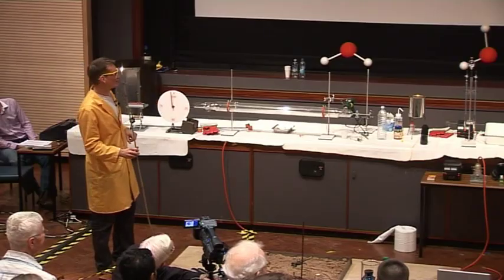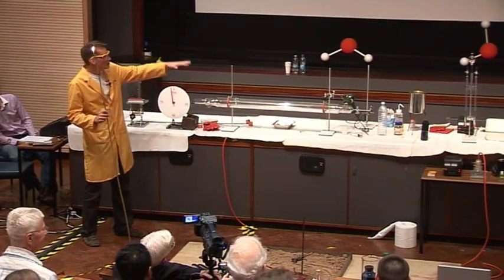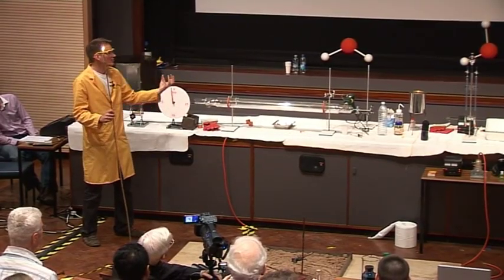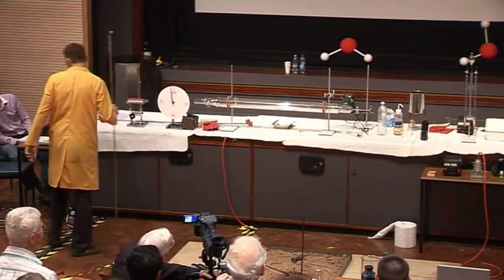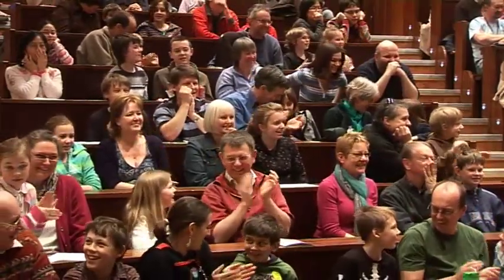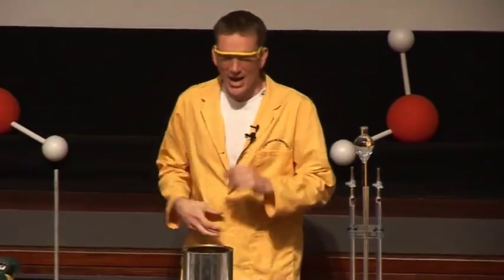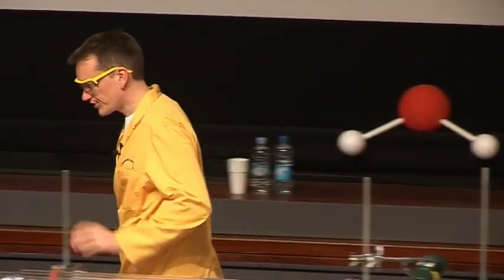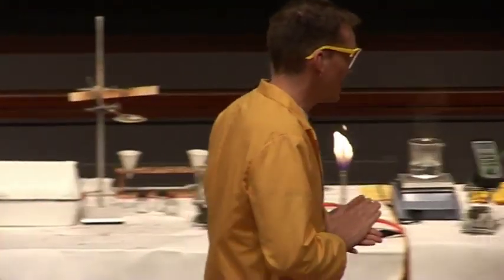I think that one wasn't quite filled properly. This one should go a little bit better. Okay, so say hydrogen coming out, burning quietly, air is coming in the bottom, and we're going to get just the right mix in any second. Okay, now, so we've seen the reaction of hydrogen and oxygen, and when we get it mixed just right, we get a nice loud bang. And I need a volunteer for this next experiment.